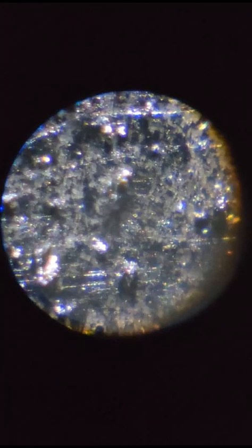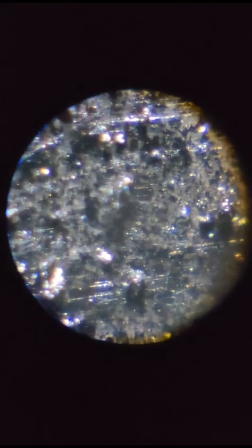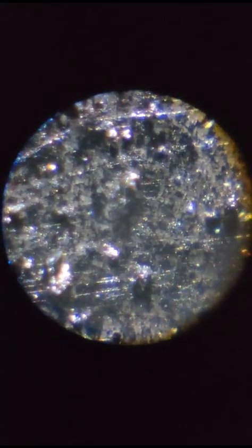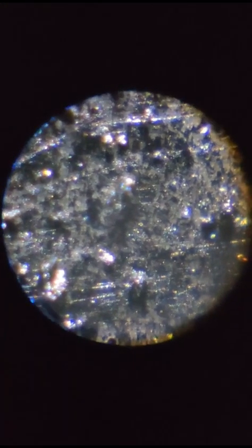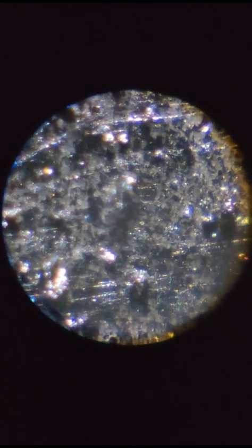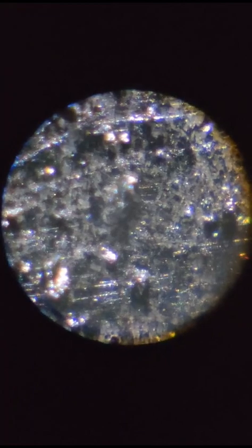Now let's see. Zoom in and see 200 times. Now we have to zoom in to 200 times. How does it look? This is 200 times. We paused the video and we settled something. Just don't bother what we settled. But this is 200 times.